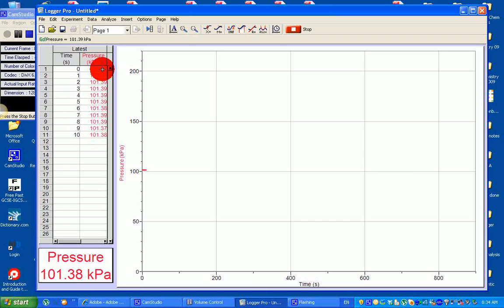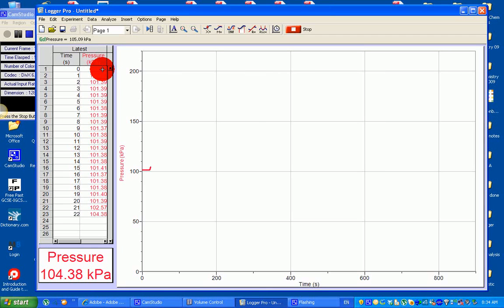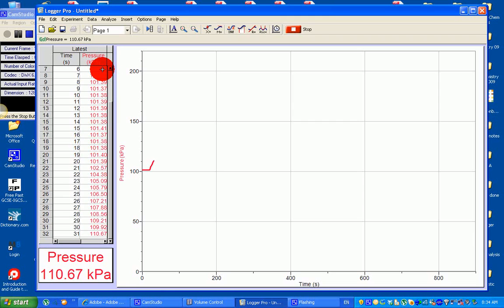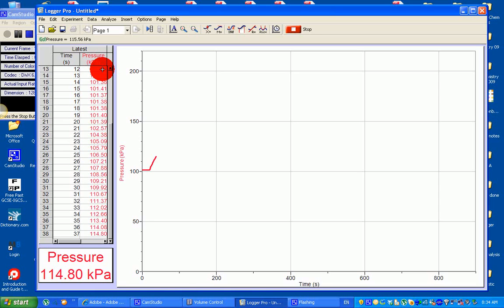Once I add it, I'm going to use the pressure sensor to measure the pressure buildup. Pressure starts to build up — there's a pressure increase now. I'm going to measure the initial rate of reaction, probably using the first 20 seconds. That will represent my initial rate.